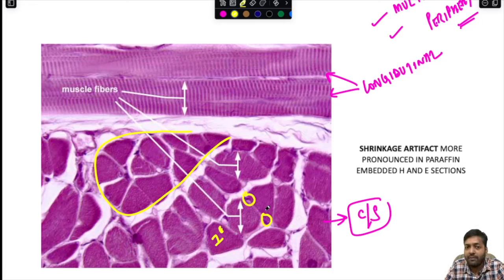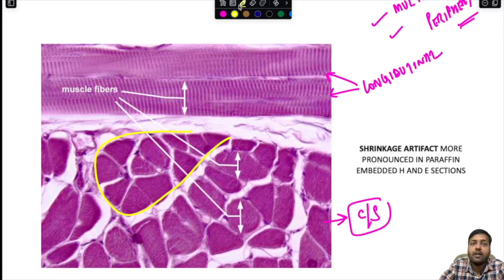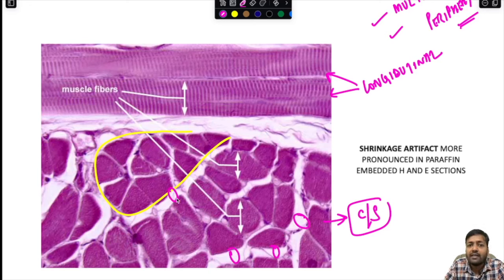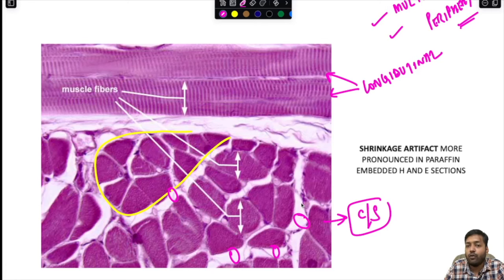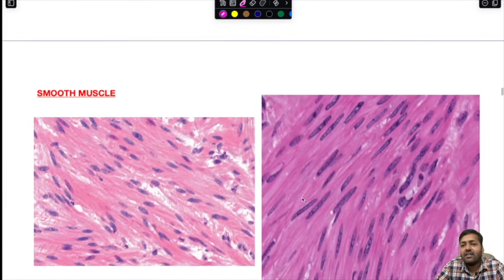One important artifact to note is the shrinkage artifact — spaces seen between muscle fibers. This is more pronounced in paraffin-embedded H&E sections compared to frozen sections. Shrinkage artifact is not seen in frozen sections but is more common in paraffin-embedded tissues.